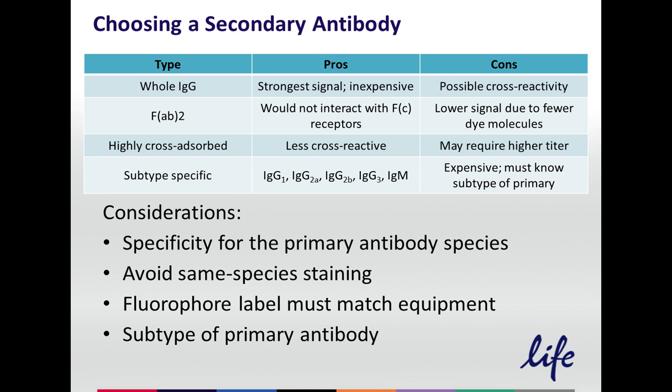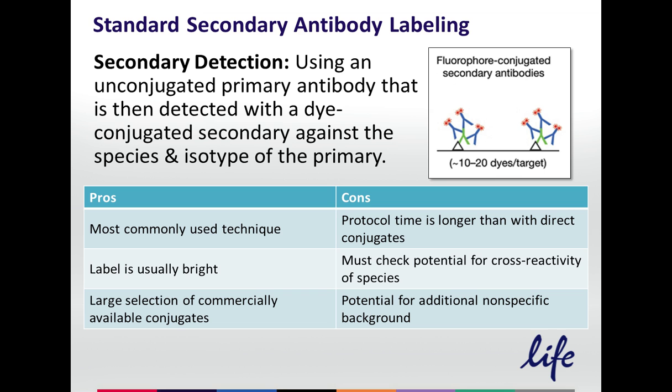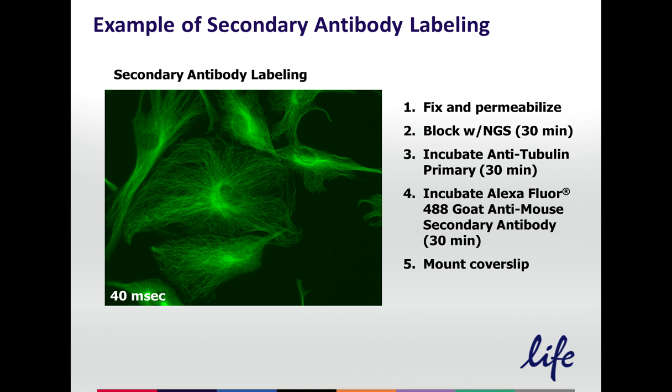Okay, so those are some of the considerations for choosing a secondary antibody. And the same sites that I mentioned before you can go to help find a secondary. Again, we have a selection guide at lifetechnologies.com, or you can also go to biocompare.com or linscottsdirectory.com. Okay, continuing on. You'll also potentially be getting a survey here at this slide.